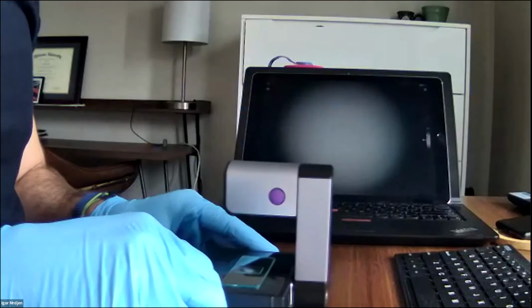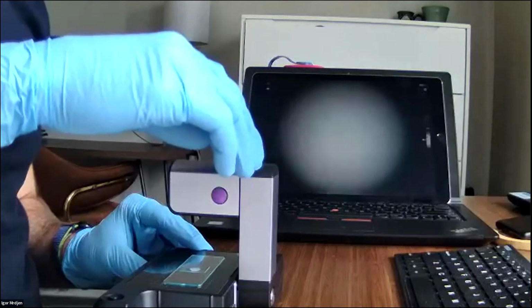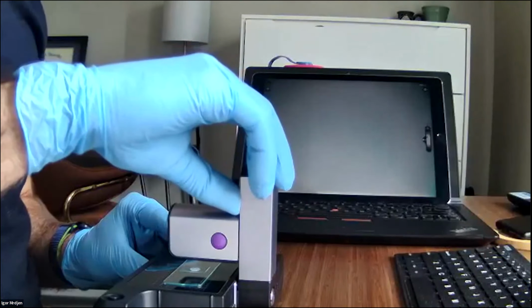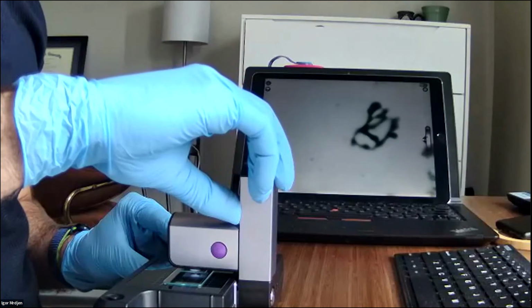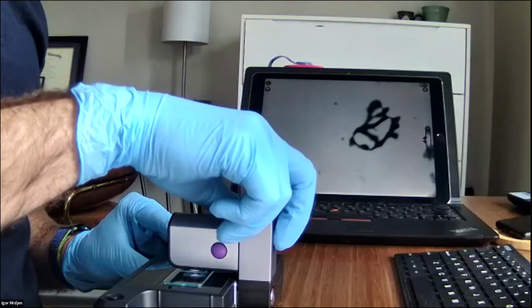And so now I'm going to try to do this without blocking your view. I'm going to press down on the mast until things start popping up on the screen there. And pardon me for being clumsy about this. It's hard to do when you're doing it offhand. And there's a nice Microcystis colony right there.